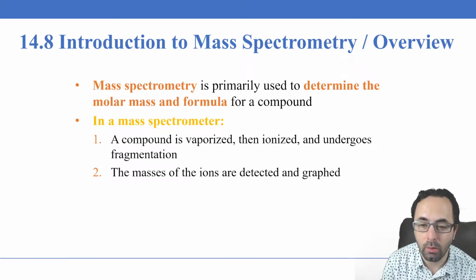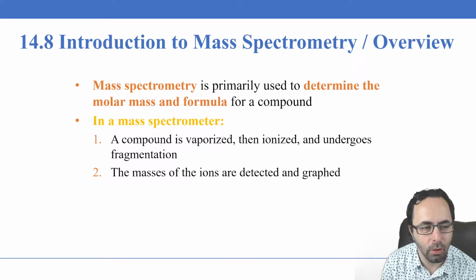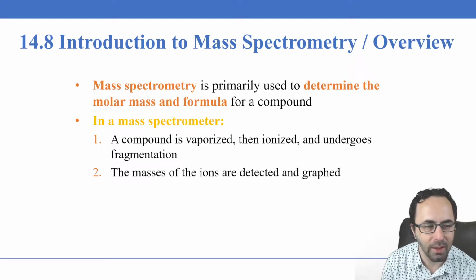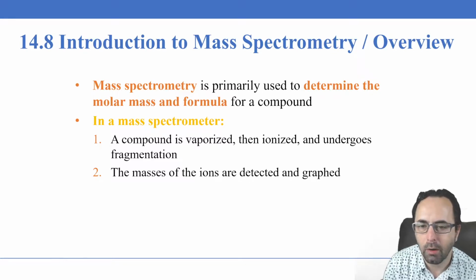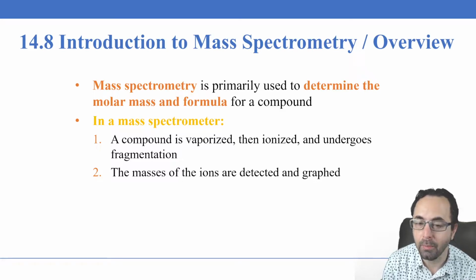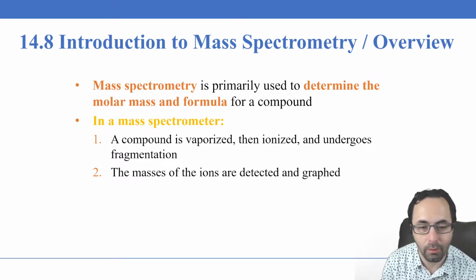Namely, it will tell us more about what chunks of the molecule are connected to what other chunks of the molecule. So mass spectrometry is, in a sense, a destructive technique. A lot of times it will smash the molecule apart, and we'll get to see various pieces of it. By determining what the various pieces are, we could see how they might have fit together in the molecule.